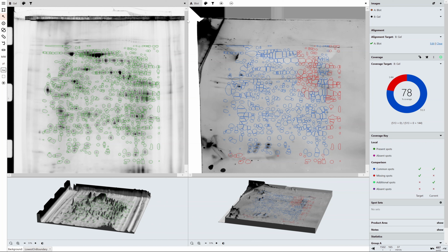So we move forward into another measure of reliability and reproducibility, which is the fact that we propagate the spot map, this map of all spots, this 100% network or population of spots within an image, to every image. So I'm only using 2 here, but SpotMap can support as many images open at once as your computer can handle. We propagate the same spot map to everything.